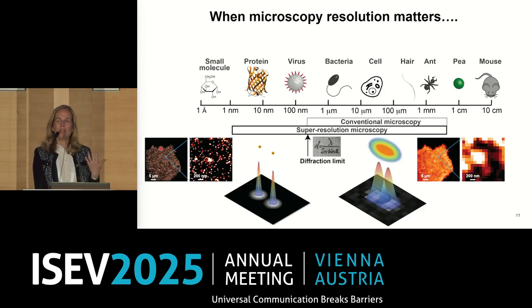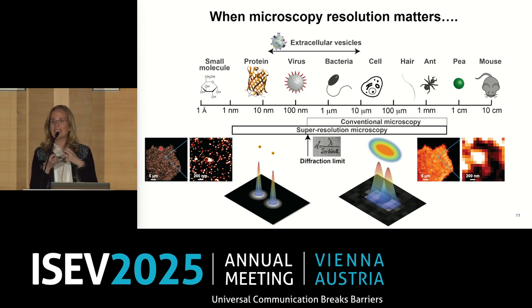And when I was trying to think about what I can tell you about advances and challenges of particular techniques, obviously, I go back to something that I use a lot in my lab, and that's microscopy. So there is really a wealth of information classical, conventional fluorescence microscopy can give us, but vesicles are small, right? And they have these heterogeneous sizes, and because of this, we actually have to think, if those two vesicles are really close together, maybe I cannot resolve them, and that's when this resolution really matters.